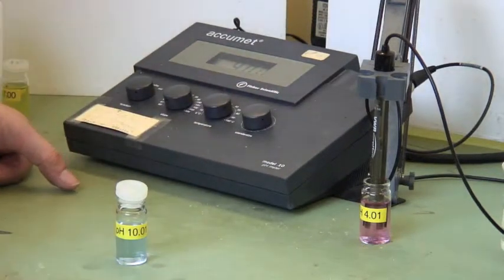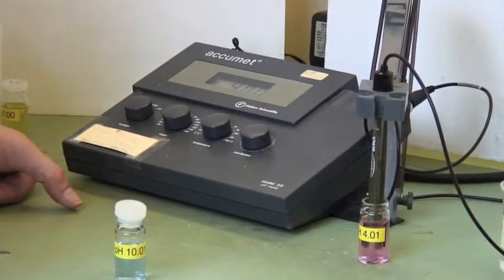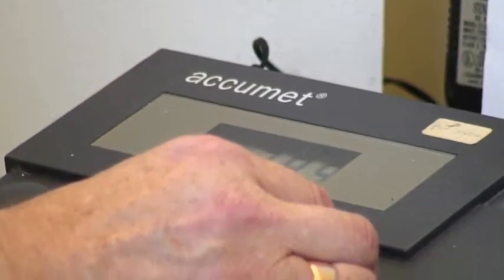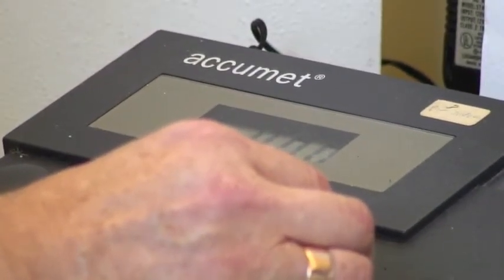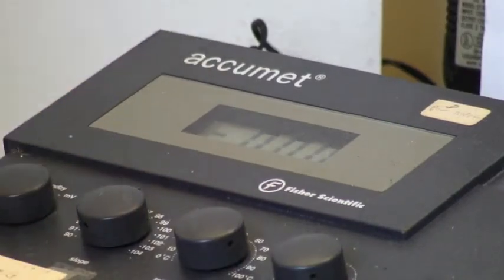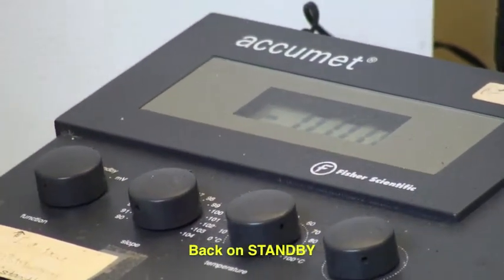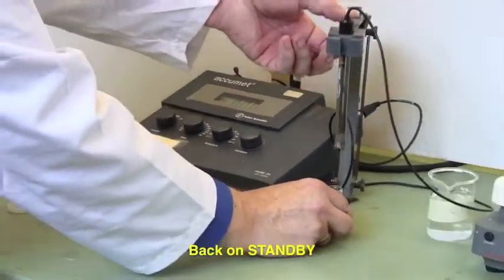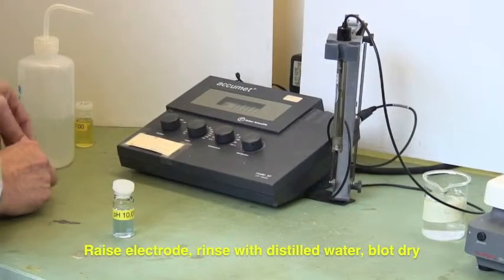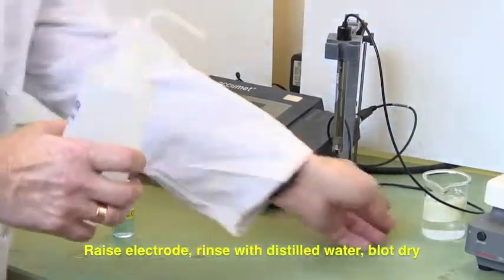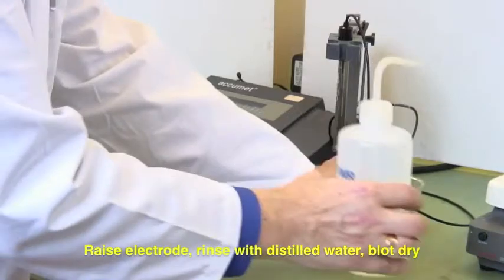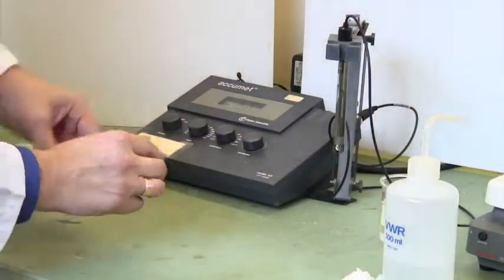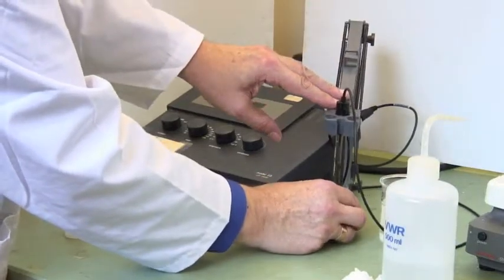That's set at 4.01. Put it on standby for the second calibration. Lift it from the buffer solution, replace the cap, rinse the electrode, and blot it again. Now place it into the pH 10 buffer.